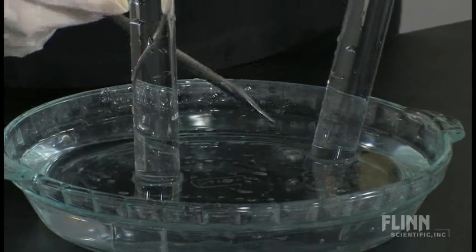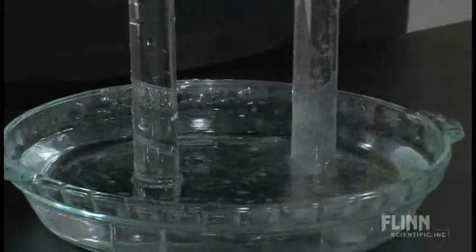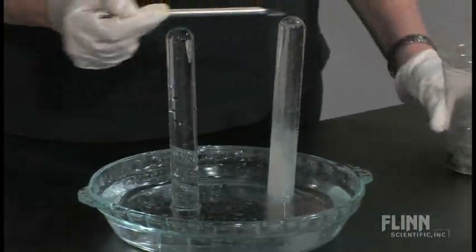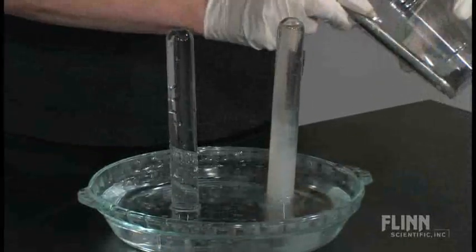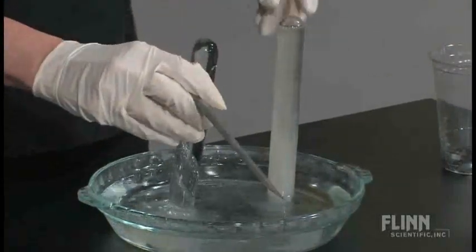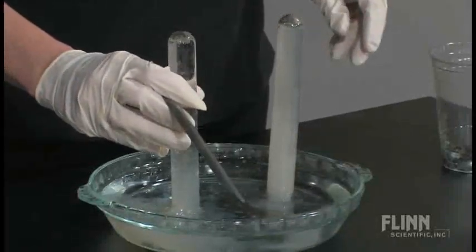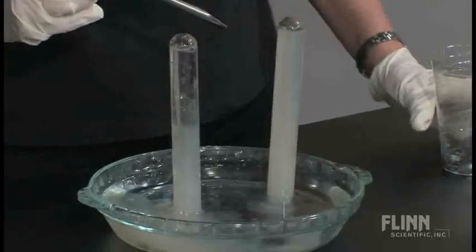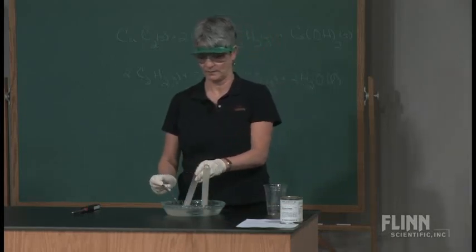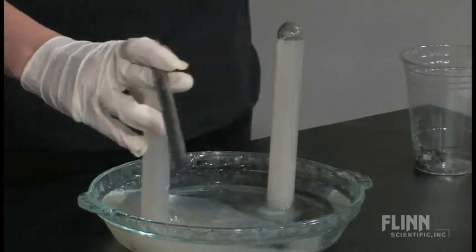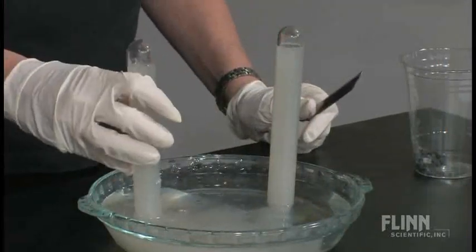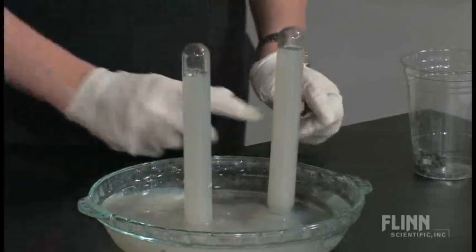So if you look, you can see bubbles forming immediately here and you can see that solid precipitate, the calcium hydroxide. So I've got two test tubes catching the bubbles. It does get really messy after a while so it's harder to see where the pieces of calcium carbide are to catch.